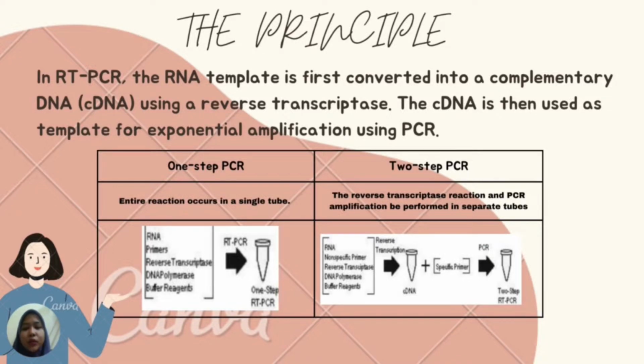In the one-step approach, the entire reaction occurs in a single tube. In two-step reaction, the reverse transcriptase reaction and PCR amplification will be performed in separate tubes. There are protocols in both types of PCR.